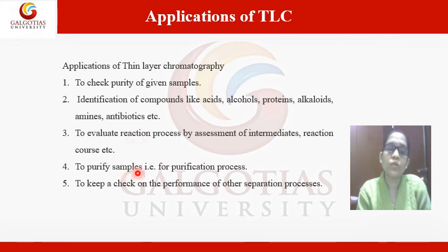Then for the purification of samples there is a process known as preparative TLC, in which we can purify the compounds. Also TLC can be used to keep a check on the performance of other separation processes. So there are several applications of TLC. Nowadays we are using some advanced techniques of TLC.